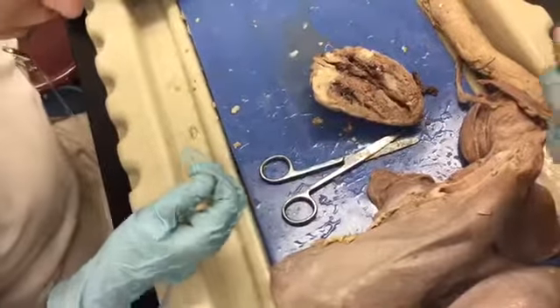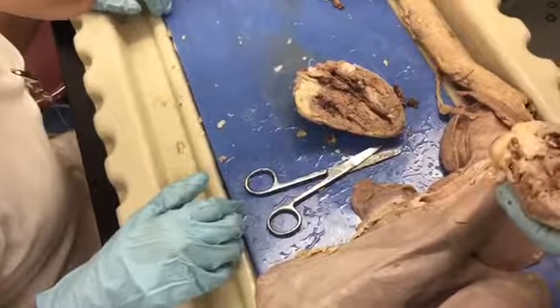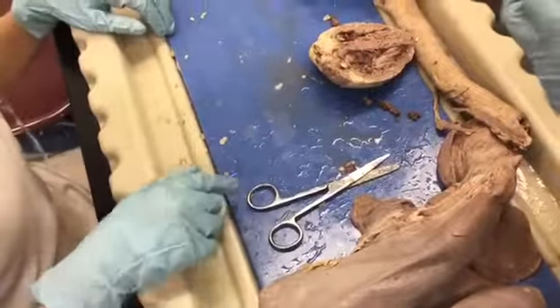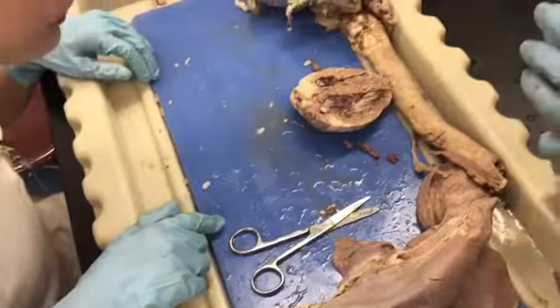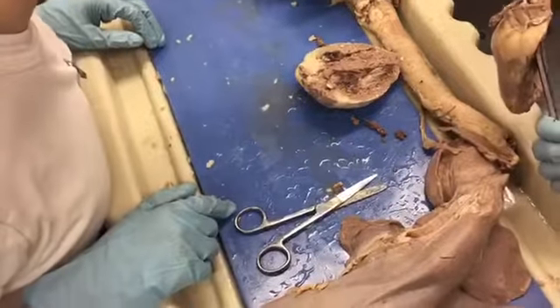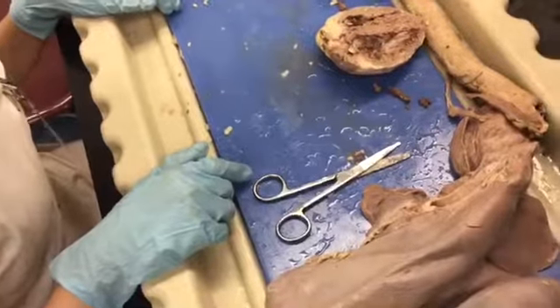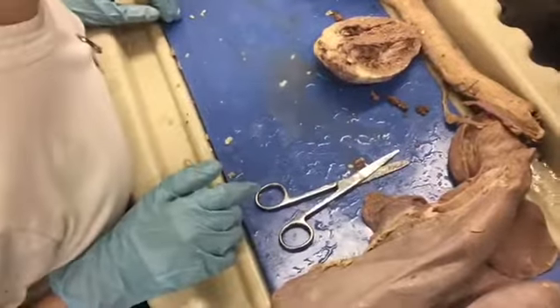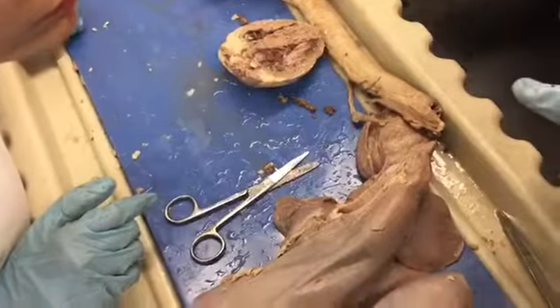Somewhere around here. I think we cut it kind of in half, so it's hard to see. Yeah, I did a crappy job. Oh, it's okay. It's the scissors that gave me a hard time. Right here, that's your pulmonary. So it goes above. Yep. And you can even see that's a pretty thick type of tissue right there. So your aorta is really thick coming out.